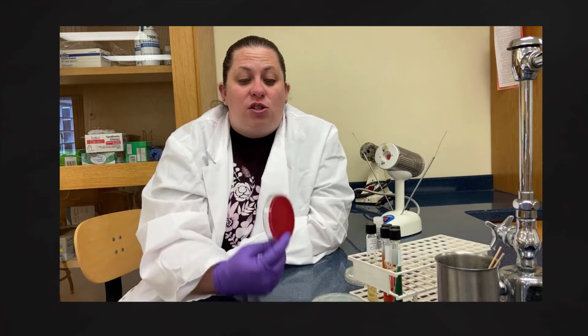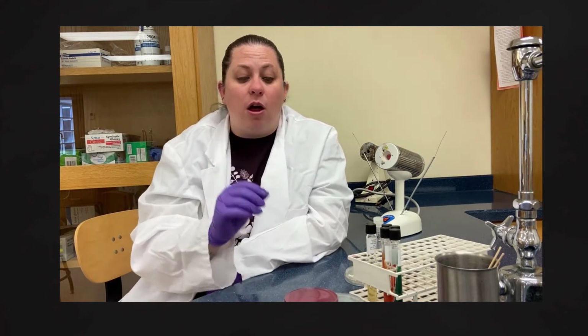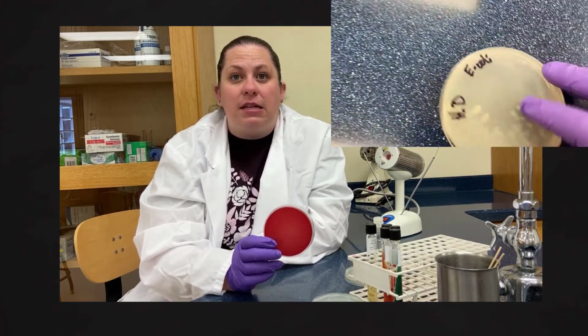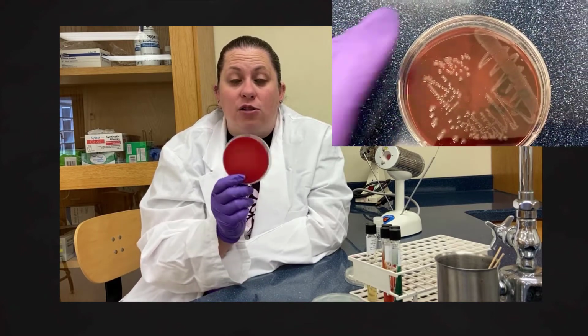All right, so when we look at these different types of media, there's different ways that we would need to be able to inoculate them. On our plates, we're going to do the streak method. Unlike what we saw in the spread plate method where we wanted to cover the whole thing with the bacteria to create a lawn, in these particular cases, when we do a streak plate, we want to actually get individual colonies. All right, this allows us to look at the colony growth where we can identify what the colonies look like, if they're domed, if they're symmetrical, if they're irregular on the sides, if they're sticky. It allows us to get a lot of information just by looking at how they're growing on the actual plate.